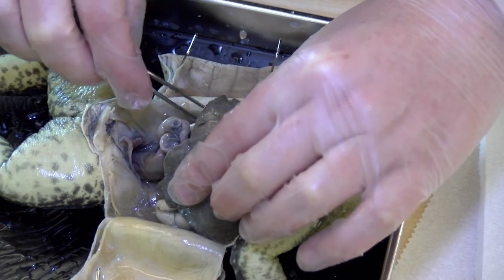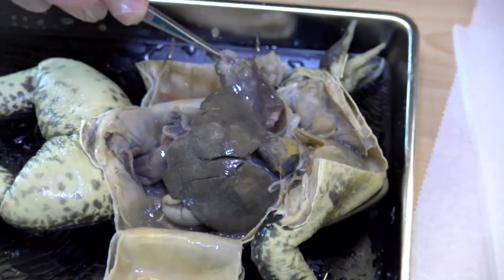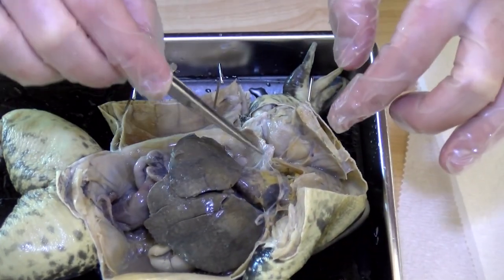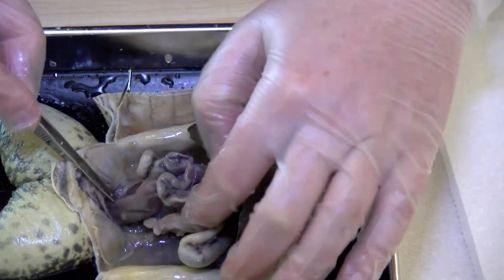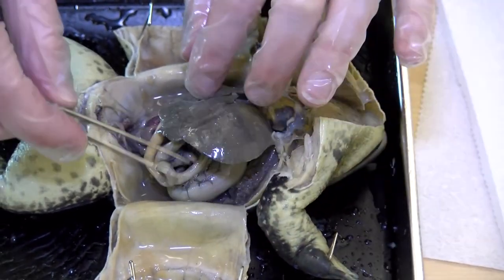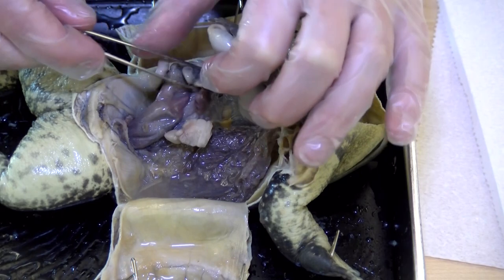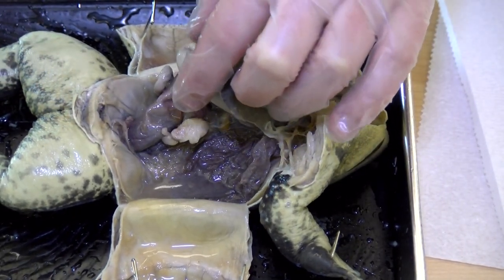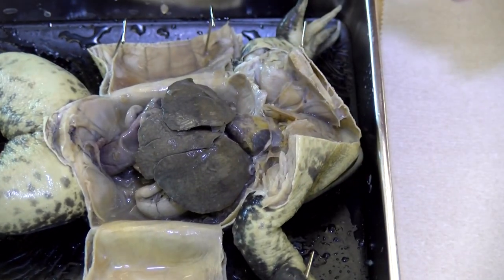On this side we also have the other lung. So just like a human, we've got heart, liver, lungs, stomach, small intestine, and large intestine. We could also find towards the back the kidneys. And further along the spine you would be able to find the gallbladder, the pancreas, the spleen, and other organs that are very similar to those of a human.